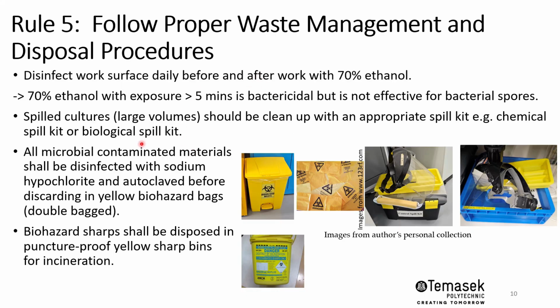Any spilled bacterial culture or microorganism culture, especially in large volume, should be cleaned up with appropriate spill kits. This could be your biological spill kits if they are bacterial cultures. The biological spill kits that we have in the lab look like this on the right. If you have a chemical that is mixed together with the cultures, or they are chemical in nature, then the chemical spill kits need to be used. In any case, do notify your tutor, your lecturer, or your supervisor if you're heading out for your internship, if there's a spillage, so that the cleanup and management of it can be done properly.